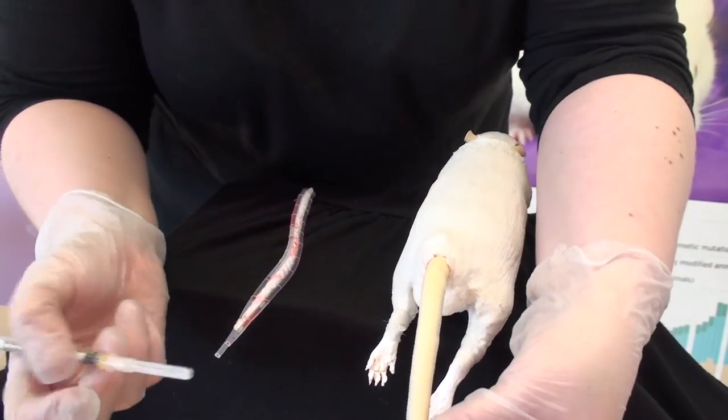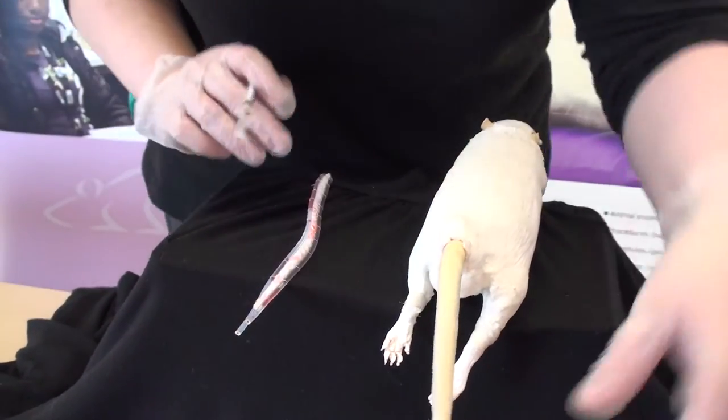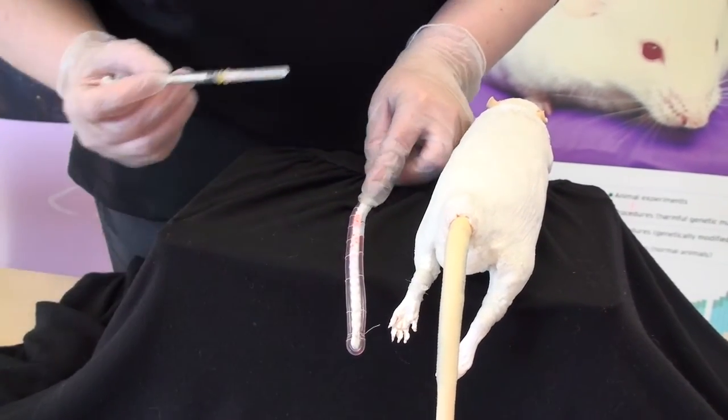A rat has veins that run along either side of its tail, and you can see that darker colour on either side. We have our model here so you can actually see the veins along each side.